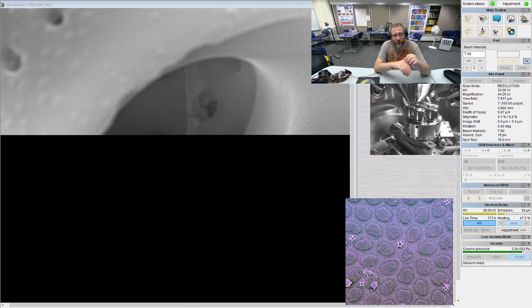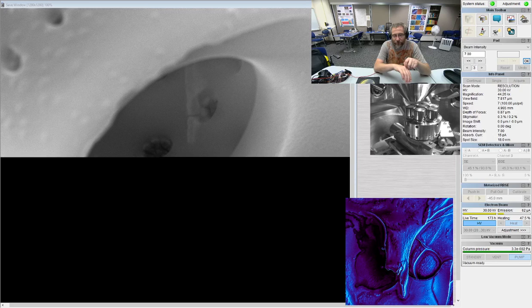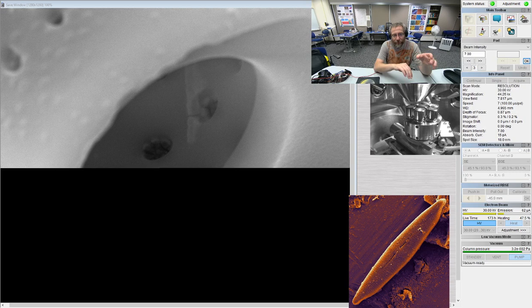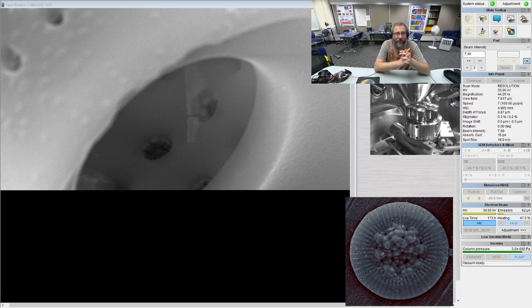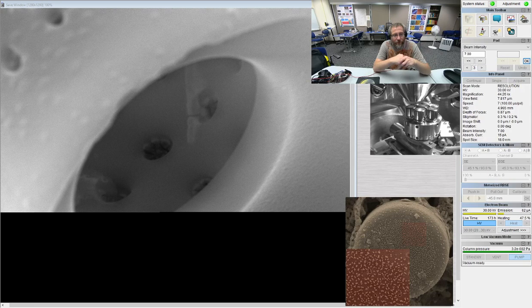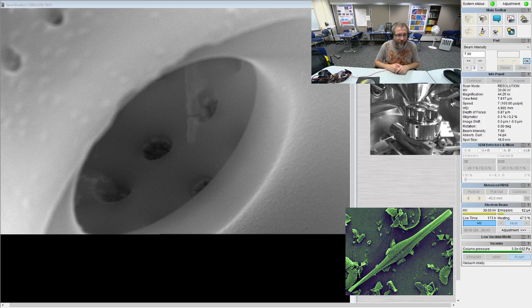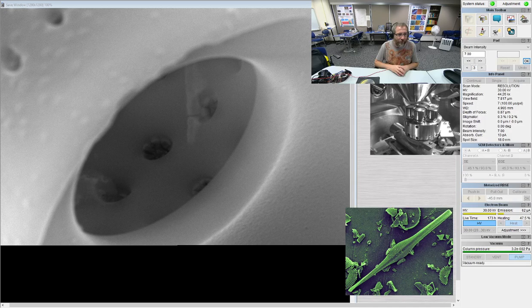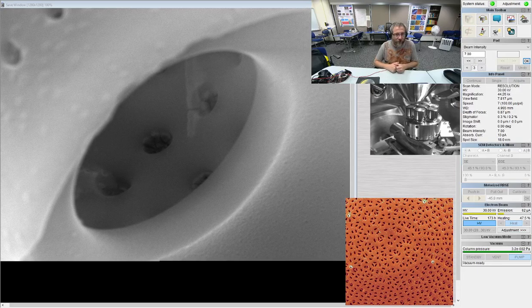Is there a better scanner, faster or more zoom? Yes, all of those things are possible. This is a tungsten-based SEM, and they have a field emission-based SEM, which has a different type of element in it that can fire a tighter beam that will create a slightly better resolution image. It doesn't go any faster, not necessarily. The speed of the image it's drawing point by point is not limited by the computer speed or anything else. It's about how resolved you want the image. I could ramp up the resolution to something ridiculous, like 16,000 by 16,000, and then capture it at this speed, and it would take 7 hours to collect the image. It's based on how many pixels, and it's getting information from each pixel. But the speed has to do with the resolution.